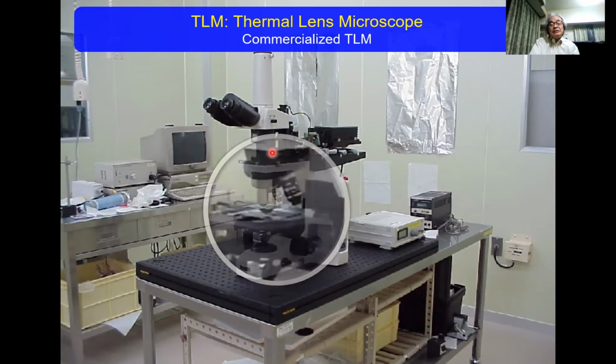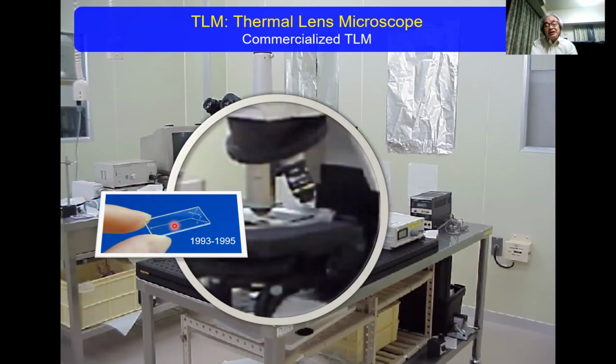This one is also our device to measure the liquid sample under the optical microscope. It has 6 inlets and 1 outlet, so we can introduce 1, 2, 3, 4, 5, 6 kinds of solutions. Without moving this device, we could detect thermal lens signals for each of the solutions.